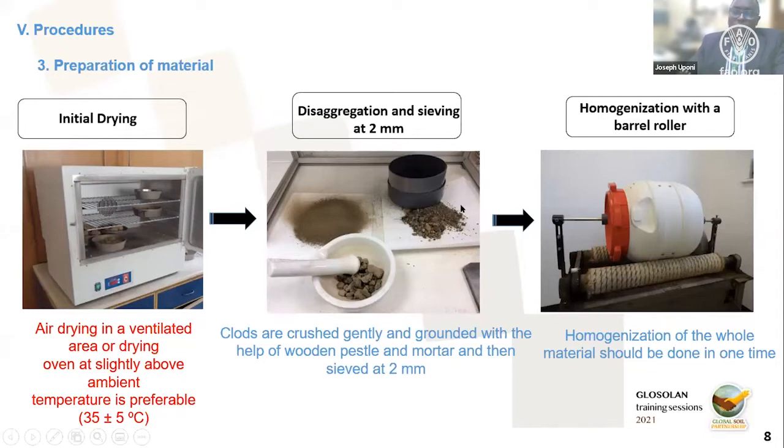For most soil analysis, we use 2 mm sieved samples. So you should have your 2 mm sieve readily available, and then also a 0.5 mm sieve. The 0.5 mm sieve is used to get finer fractions that are used for organic carbon analysis and for total nitrogen analysis. Sometimes we need to do some very fine grinding if you are going into spectroscopy analysis. I'm not going to emphasize that much now, but for spectroscopy purposes, you need very fine grinding. Now, you grind one sample at a time and you do a thorough cleanup after each grinding to be sure that you don't have cross-contamination from one sample to another.